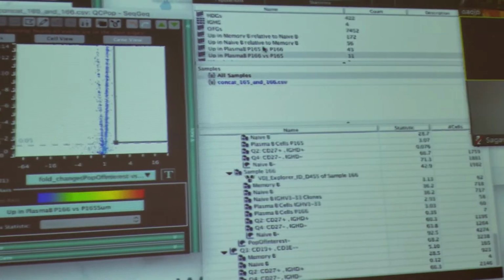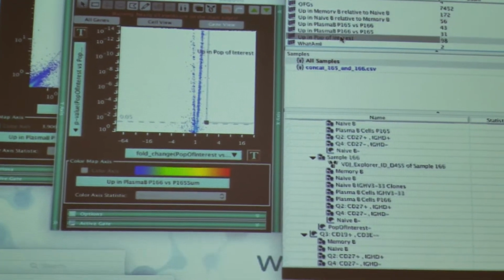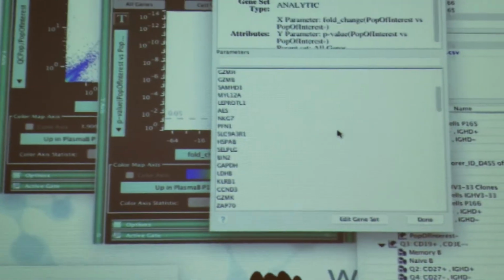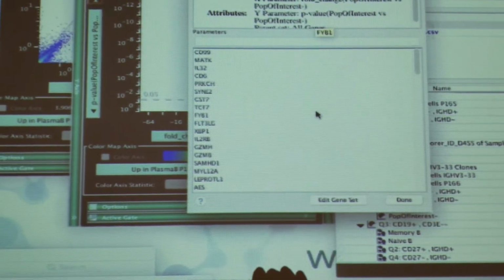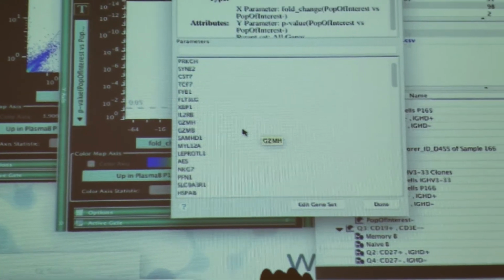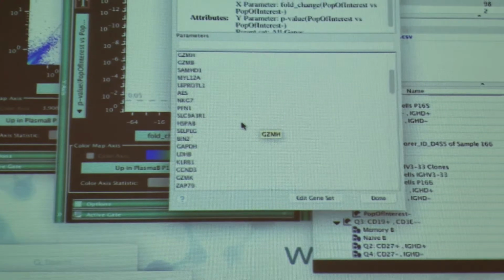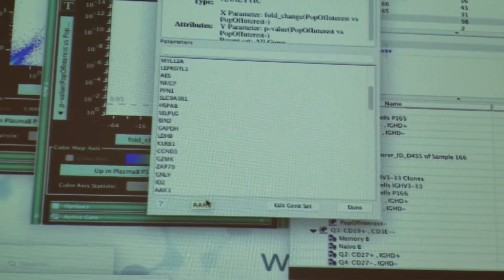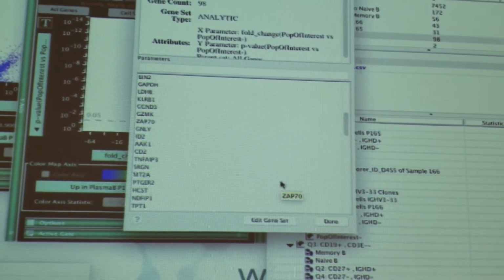Really, there's just, well, I was saying just a few genes. There are 98 genes in there. Oh, really? All right. Are these them? Quite a lot. Yeah. That's a lot. Yeah. Actually, granzyme doesn't belong. We don't want that in there. But I wonder if these are... But they all have the hemoglobin gene. Yeah. There's ID2. That's your favorite gene. Should be all B cell.